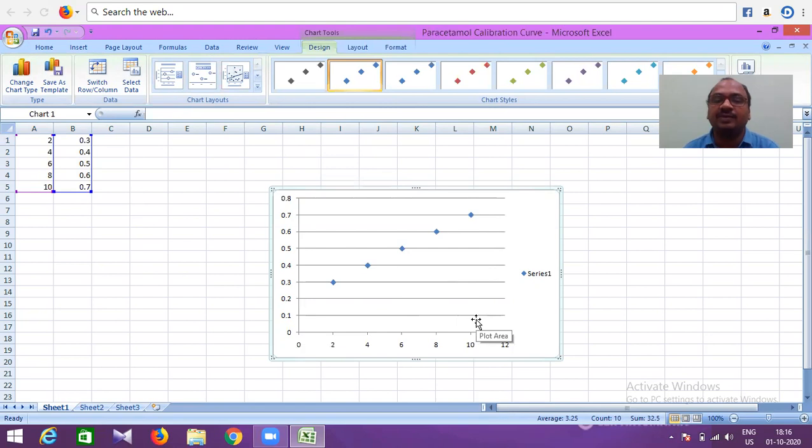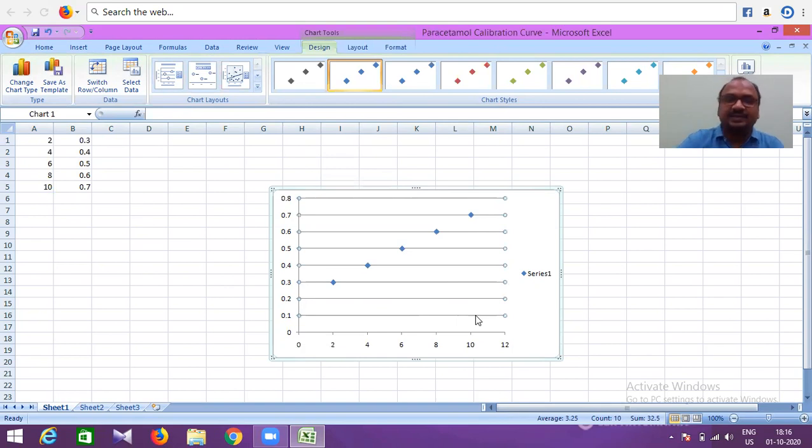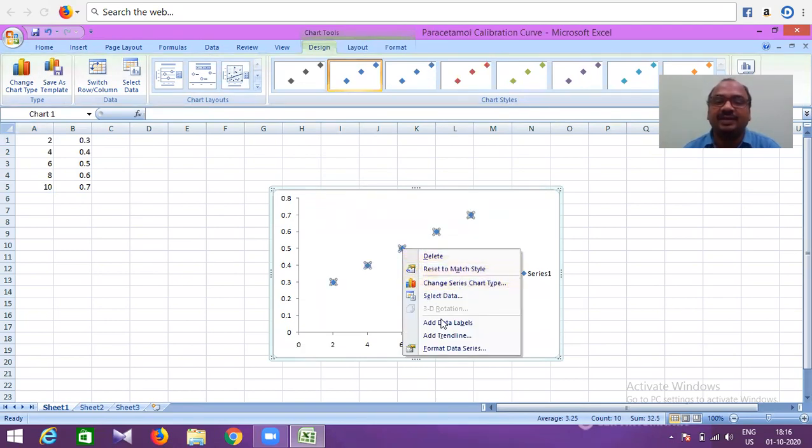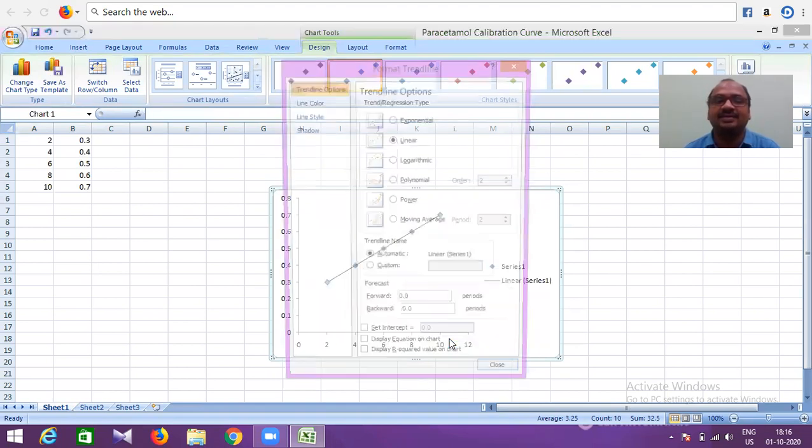Now, click on the horizontal gridlines and delete them—they're not required. Then take a right click and add a trendline.